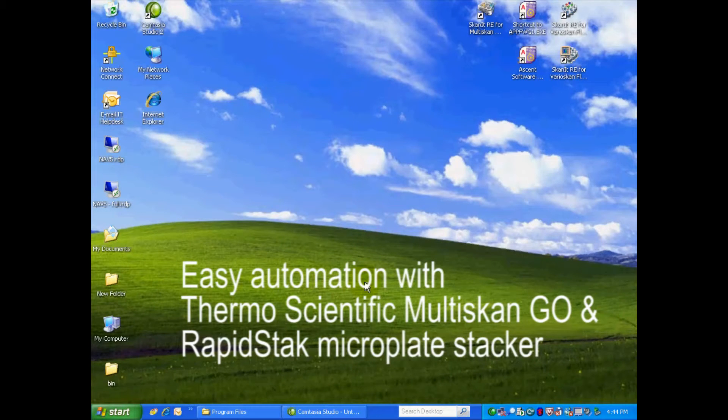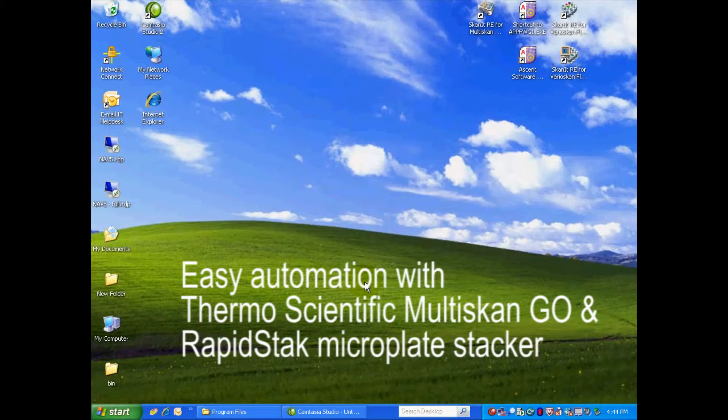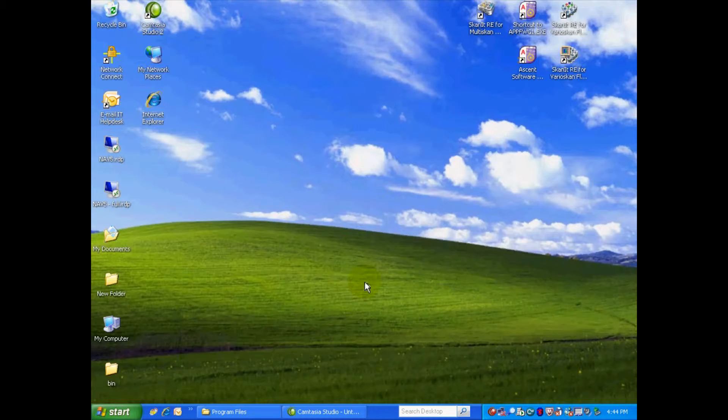Today I'm going to talk about how very easy it is to connect the Thermo Scientific Rapid Stack to the Thermo Scientific Multiscan Go.